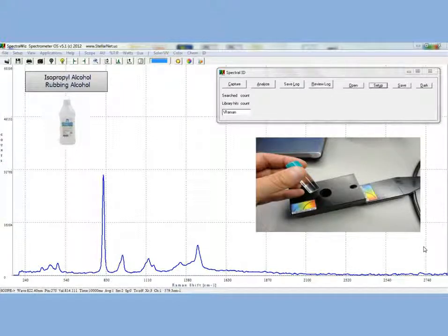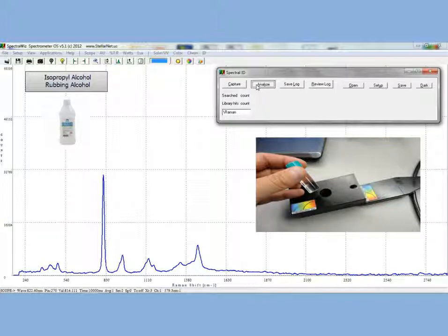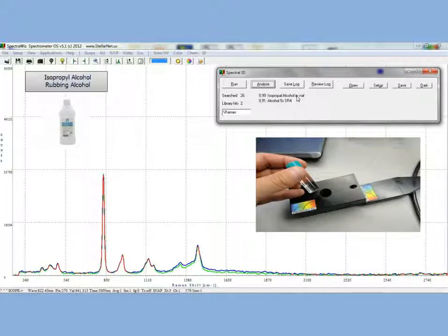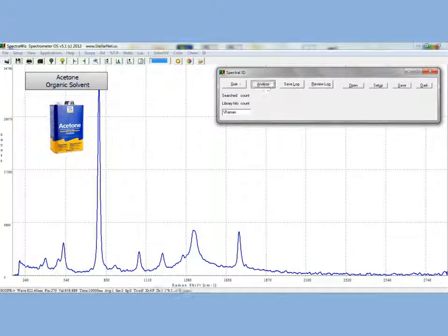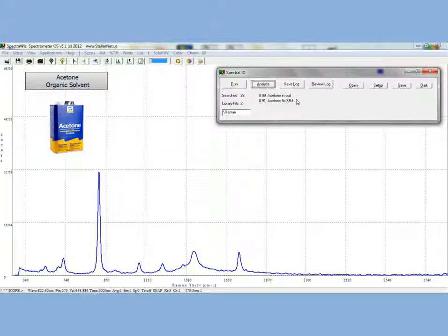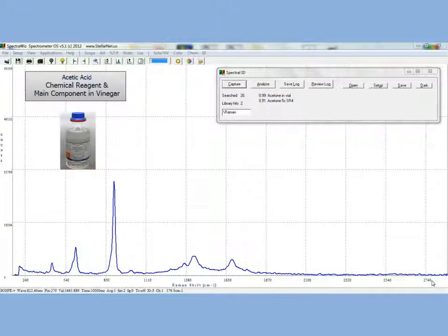Now let's look at some liquid samples. The first liquid we will look at is isopropyl alcohol, also known as rubbing alcohol. Clicking analyze, we clearly get a match. Now we will look at acetone. Here we will look at acetic acid, one of the main components in vinegar.